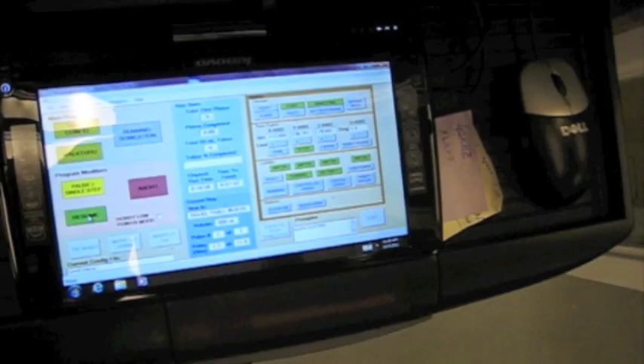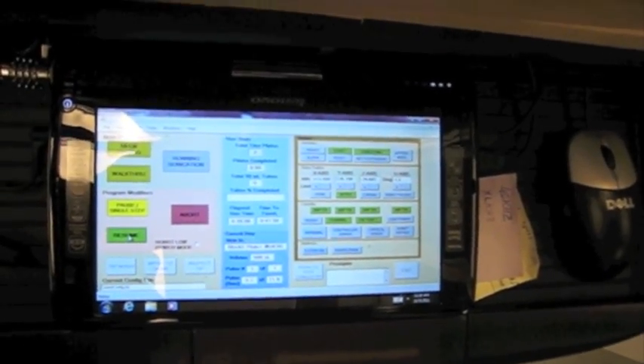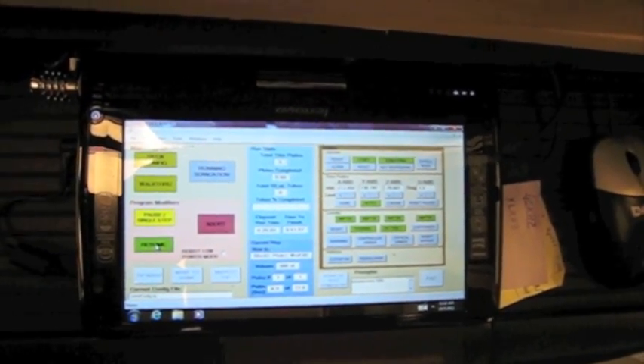The program is controlled by this touch screen panel computer, which provides both commands and status feedback from the program.